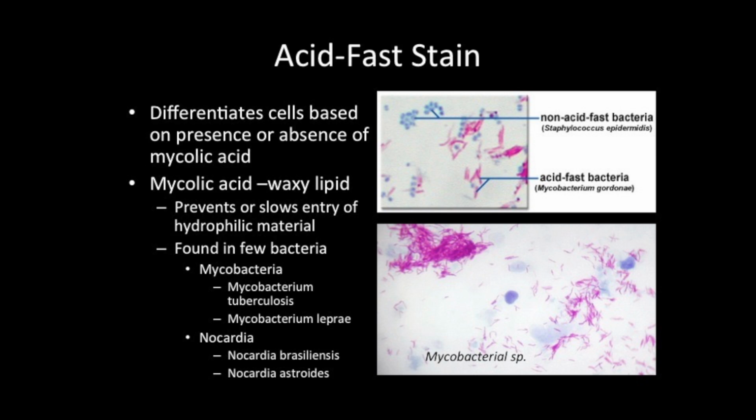The acid-fast stain is not used as frequently as the gram stain because few bacteria contain mycolic acids. However, it is a very important tool utilized when the infection is believed to be caused by an acid-fast organism.